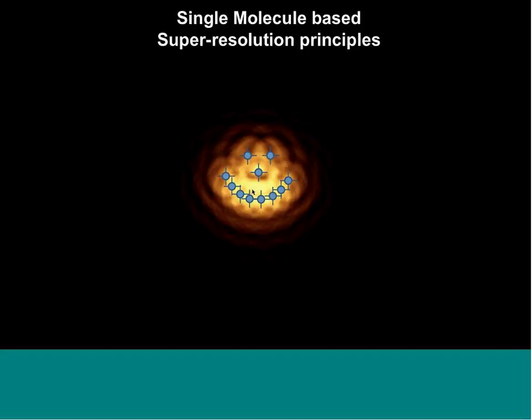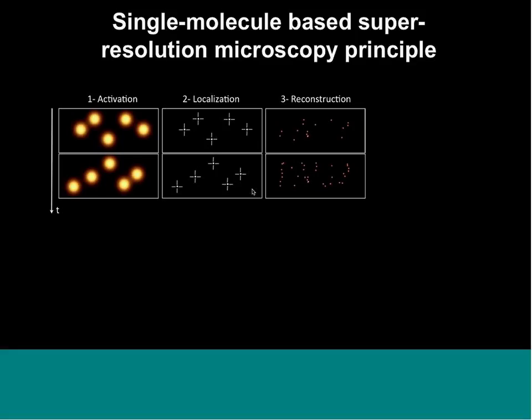This is a sequential technique where you need to localize a small pool of molecules one after the other. So, of course, that's very basic. In more practical aspects, of course, we will not turn on one molecule after the other. It's not possible. We'll use stochasticity, where molecules turn fluorescent and non-fluorescent in a stochastic manner. What you have to verify is that molecules are distant enough from each other so that you can individualize them. This is the very basic. You are limited by diffraction, but the fact that you have molecules that are sparse enough means you can have single molecules.